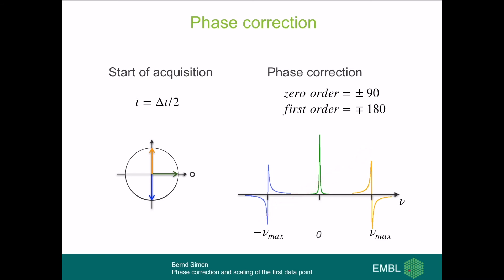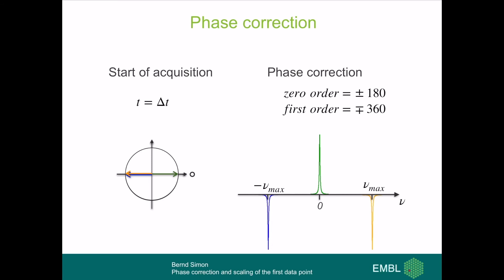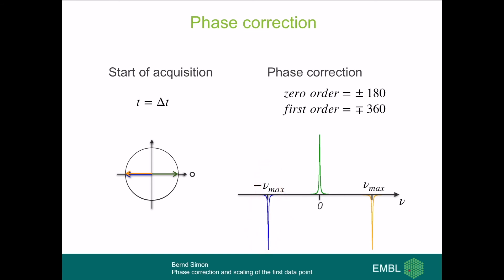Depending on the software convention, we either perform plus 90 degrees zero-order with minus 180 degrees first-order, or minus 90 degrees zero-order with plus 180 degrees first-order phase correction. At T equal to one dwell time, the fastest and slowest spins have moved 180 degrees, so they appear as negative absorption, and the peaks in between have a mixed line shape. Again, we apply a plus 180 / minus 360 phase correction, or the opposite sign depending on the software convention.